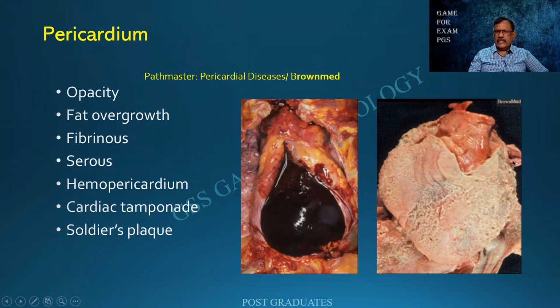And this is one of the complications of a myocardial infarction, a cardiac tamponade. Here, there has been an attempt to separate the parietal layer of the pericardium, but the visceral layer is sticking on. And I'm able to see multiple strands of this, which is a classical bread and butter pericarditis that you see in rheumatic heart disease. And the sources are the pericardial disease, Brown Med over here. I have not removed these words because the credit goes to these people for providing us with wonderful material.